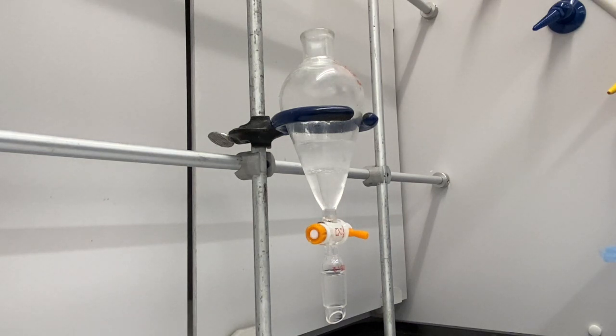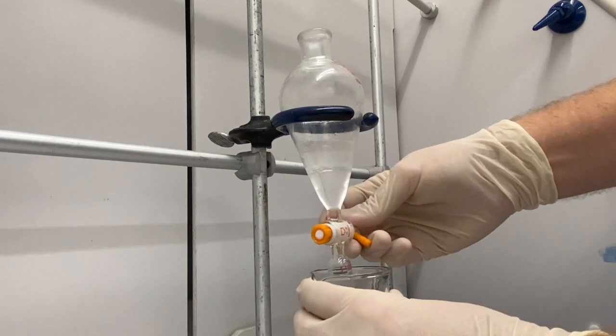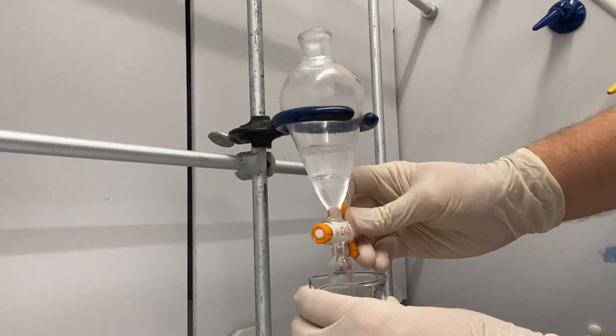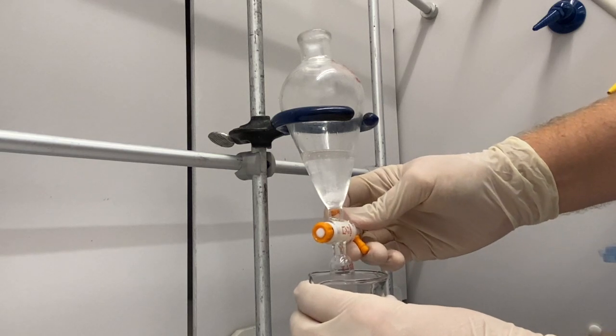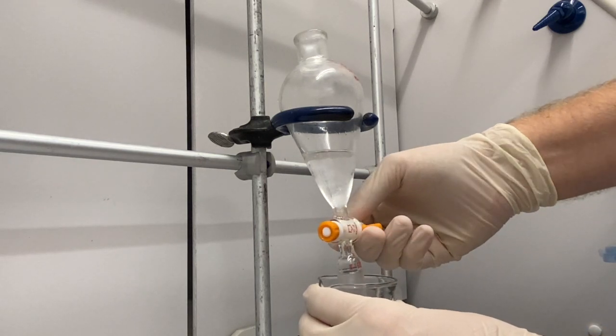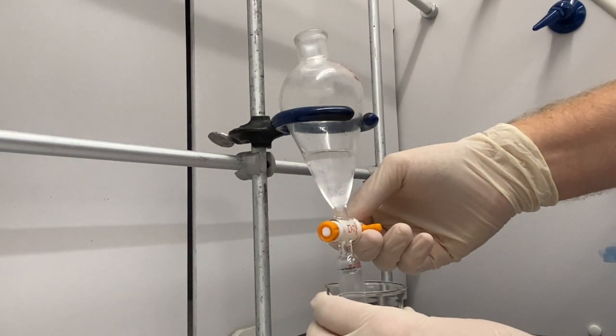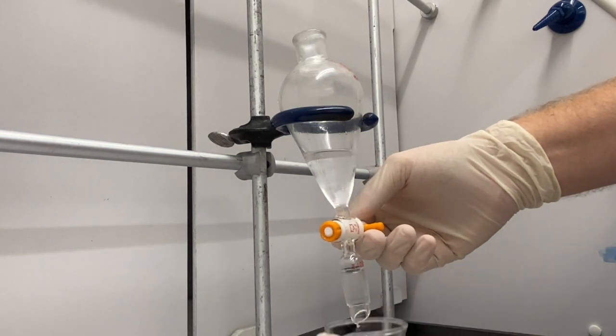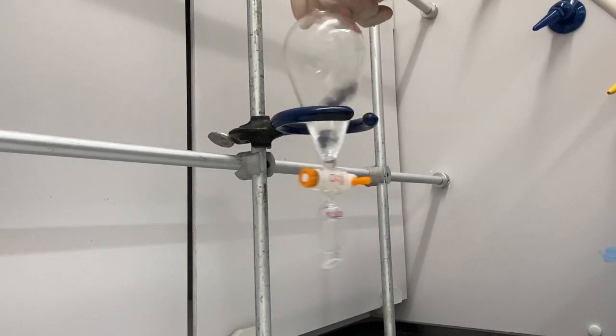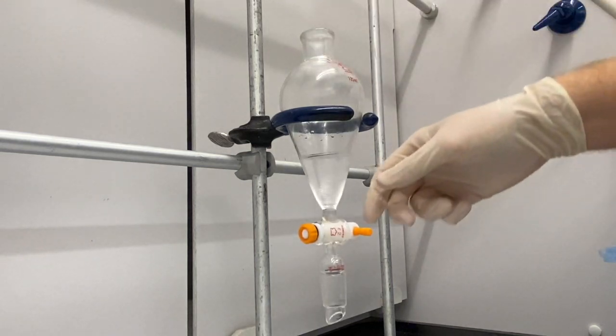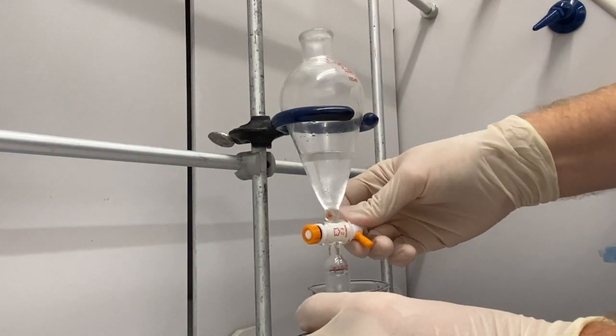Our bottom layer is our dichloromethane layer because it's more dense, so we're going to drain that out. And we want to do our best to not get any water or minimize the amount of water that we get. You can see there are bubbles falling down of more methylene chloride. Let's give that a second to settle out. We want to take the rest of that.